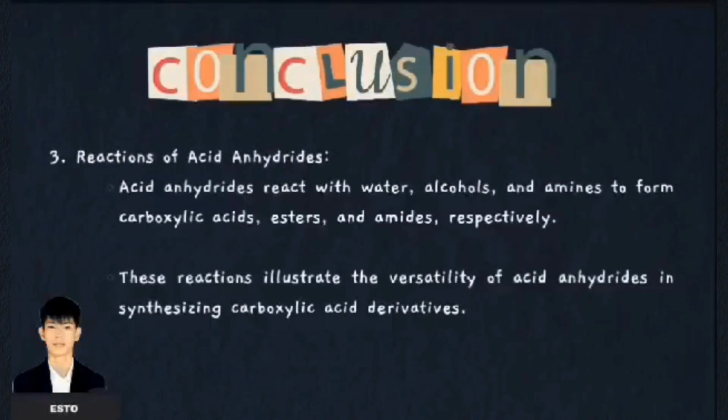Number 3. Reaction of acid anhydrides. The reactions involving acid anhydrides showcase their reactivity with water, alcohols, and amines, forming carboxylic acids, esters, and amides respectively. These experiments emphasize the practical utility of acid anhydrides in synthesizing various carboxylic acid derivatives efficiently.